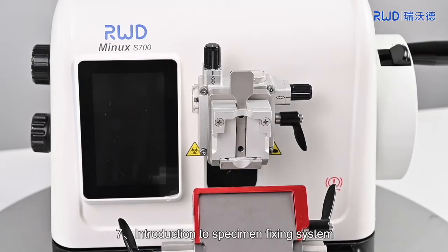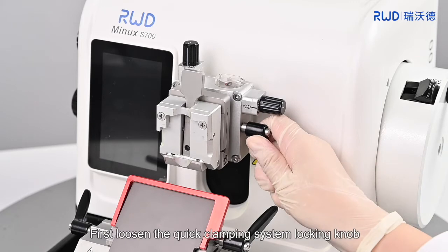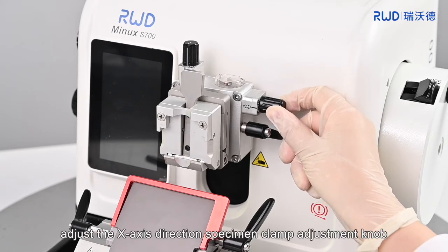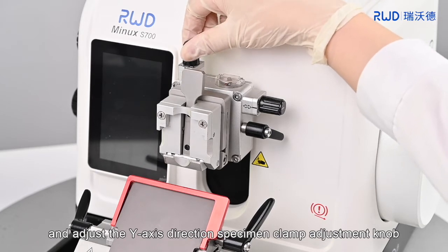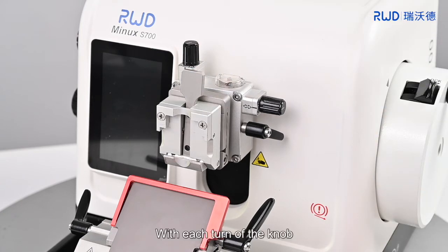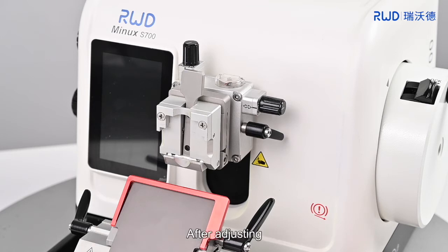7. Introduction to specimen fixing system. First, loosen the quick clamping system locking knob. After that, adjust the x-axis direction specimen clamp adjustment knob to control the angle of the x-axis direction, and adjust the y-axis direction specimen clamp adjustment knob to control the angle of the y-axis direction. With each turn of the knob, the sample will be tilted by 2 degrees, and 4 turns can be rotated in both directions. The current angle can be determined by the indicator dial. After adjusting, tighten the locking knob.